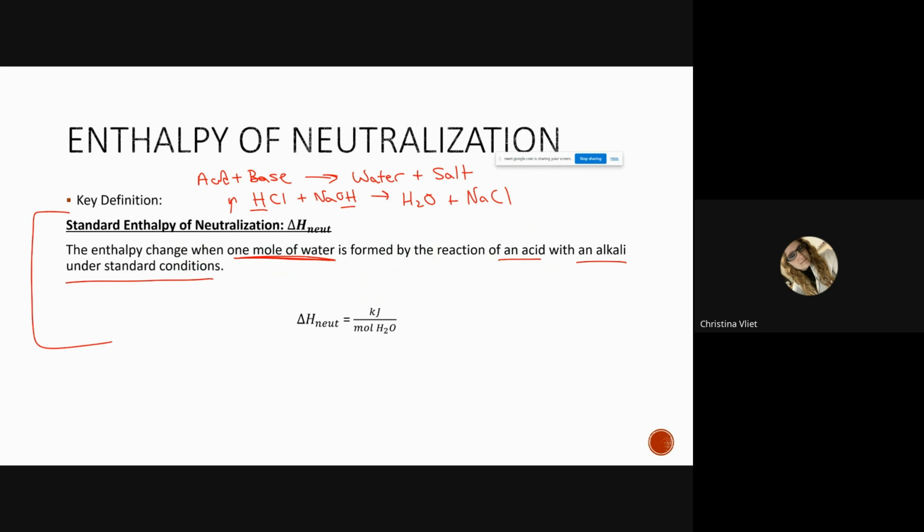So your standard enthalpy of neutralization, to get that value, is to say, what is the heat evolved when an acid reacts with the base? You're going to do something similar to this today. You're going to pour an acid and a base together, and the thermometer, the temperature is going to change. In order to get a good result, I have to give you concentrated acid and concentrated base, pretty concentrated.